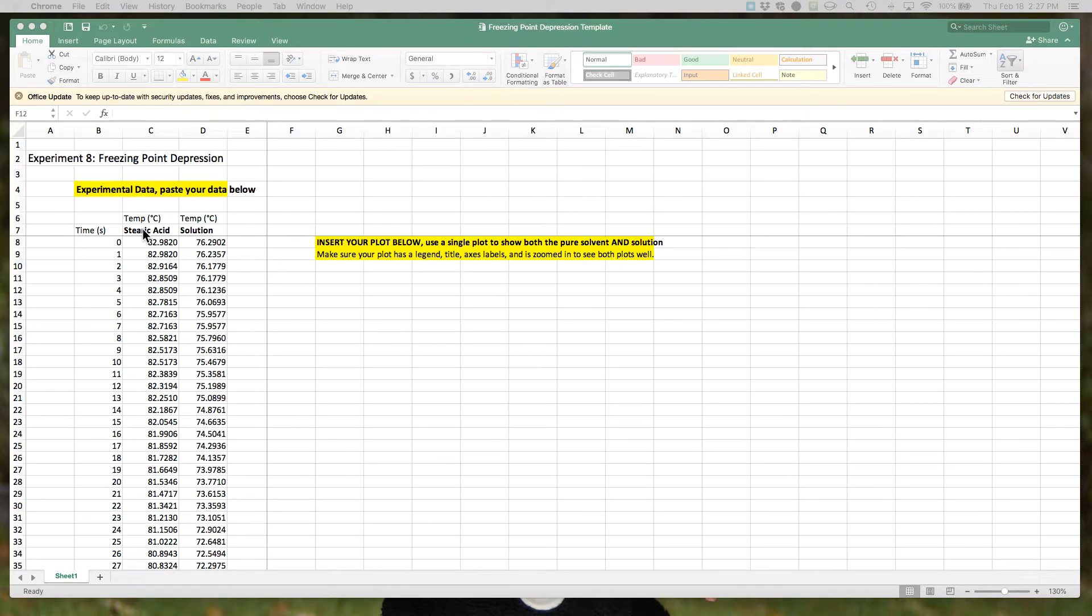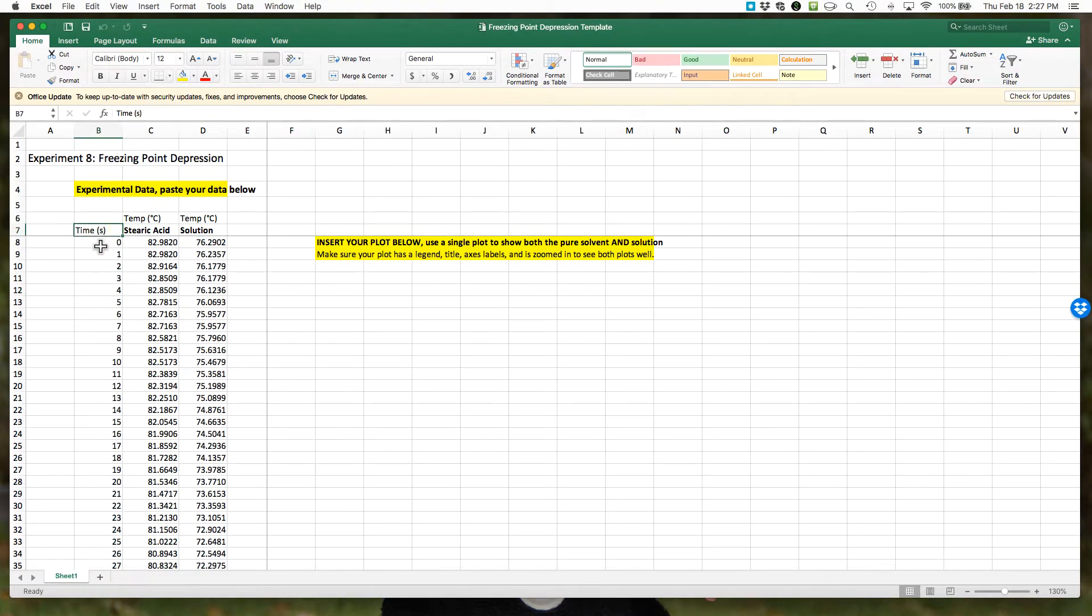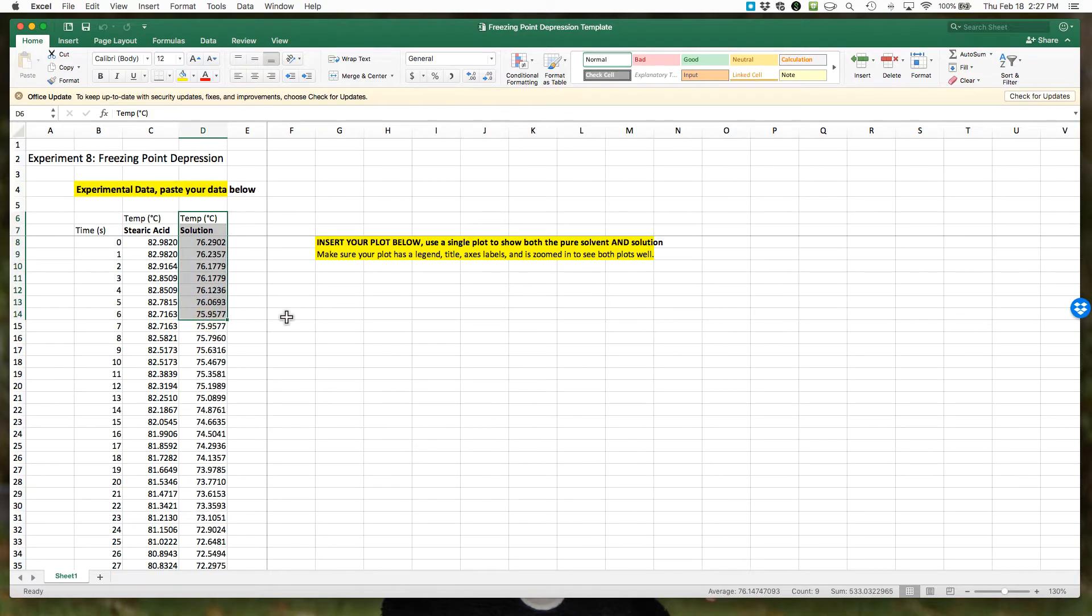What I've done so far is I've pasted in the data, so you can see I have my time and then the steric acid freezing point temperature data and the solution freezing point temperature data as well.